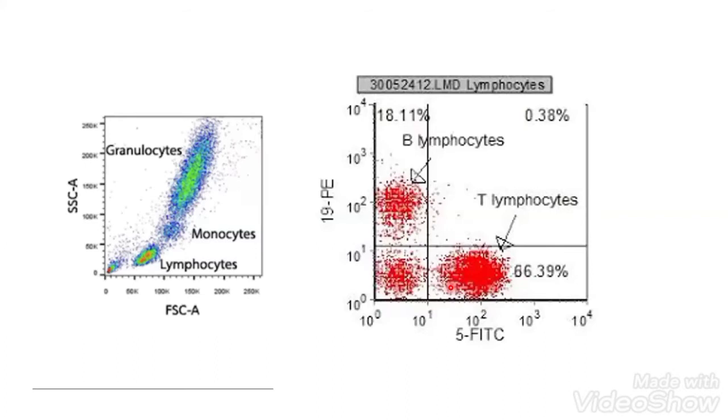It's just that you should be having the imagination and you should be having the knowledge of your biology with you, that T cells will be what? CD3 positive, and B cells will be what? CD19 positive. Very interesting experiment. Quickly, every minute you are getting one data plot. And imagine in your research study, your thesis, or in your paper, you are having 7,200 graphs like this. And you are analyzing a hell of a lot of data, and you are telling that the effect is increasing, decreasing.